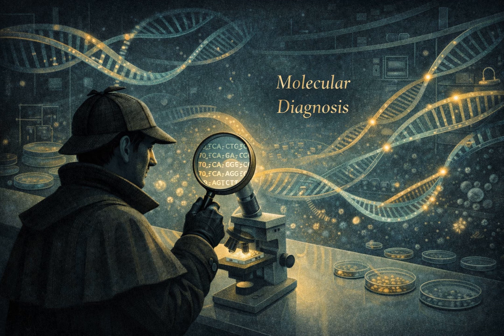A huge DNA molecule is like a long, tangled piece of spaghetti. It just gets stuck in the gel matrix and can't move. So what did pulsed field do? PFGE cleverly changed the direction of the electrical field, back and forth, side to side. This forced the big DNA snakes to constantly reorient and wiggle their way through the gel pores. It was the gold standard for outbreak tracing for decades, but WGS just gives us so much more detailed, unambiguous data now. Okay, let's shift gears completely.